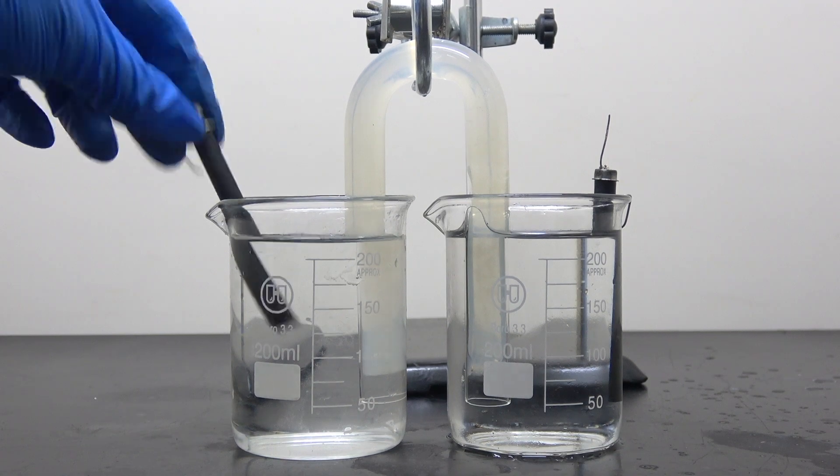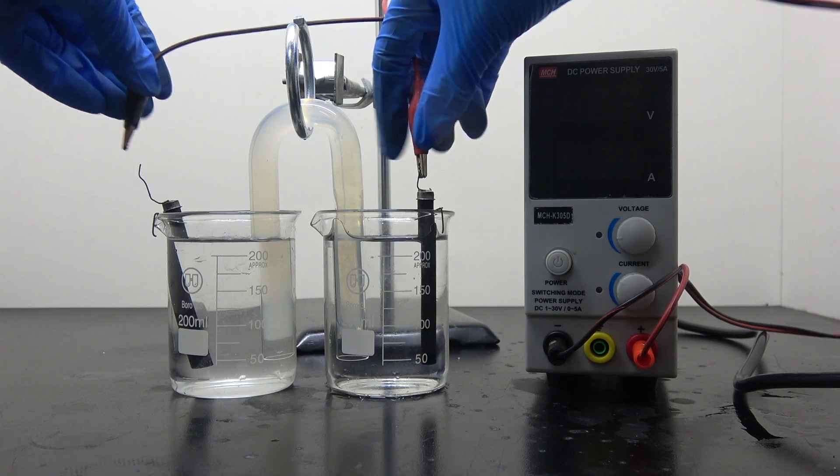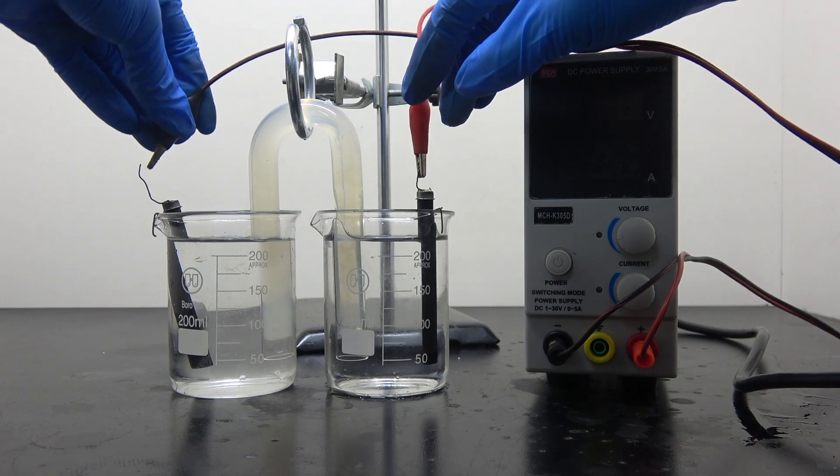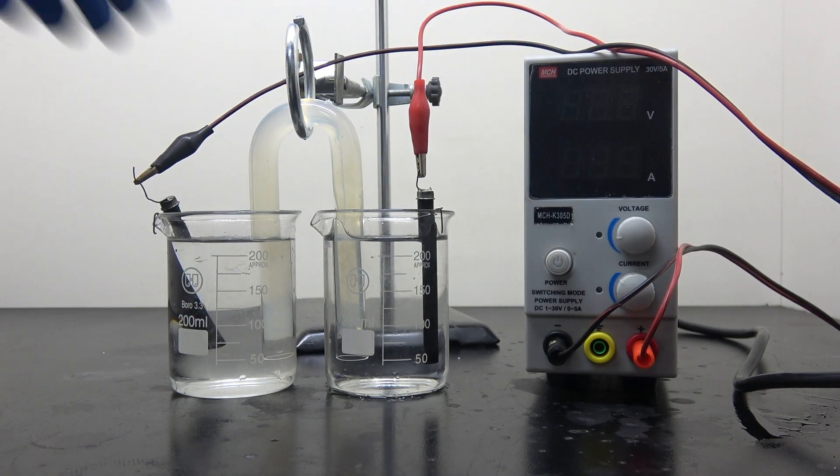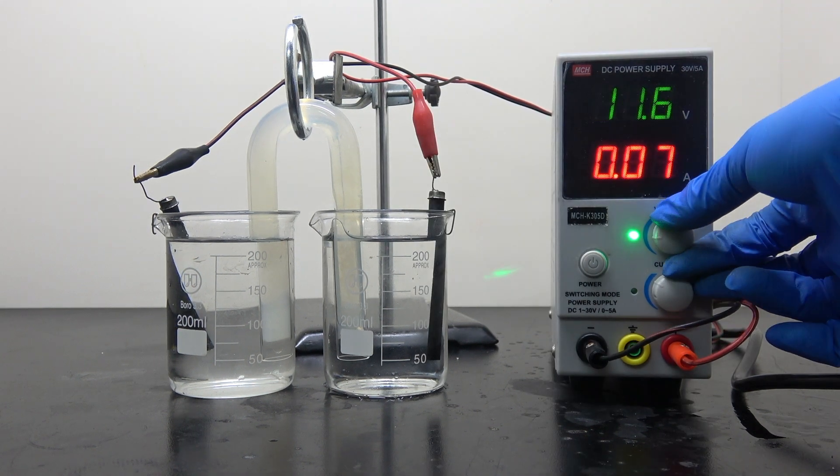Place the two electrodes into each beaker and hook them up to a DC power supply. In this particular electrolysis, the way that electrodes are connected does not matter as much. The only difference it makes is in which beaker the bromine will be produced.